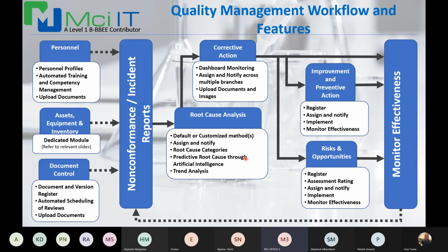So getting back to that, in terms of non-conformances and incident reports, the flow is such that root cause analysis is performed. Now, for each of these modules, I just want to add, you obviously have all the necessary input forms that can be further configured as well. So for an incident or non-conformance, in conducting root cause analysis, we can configure the system to cater for different methods. Different organizations use different methods to determine root cause analysis.